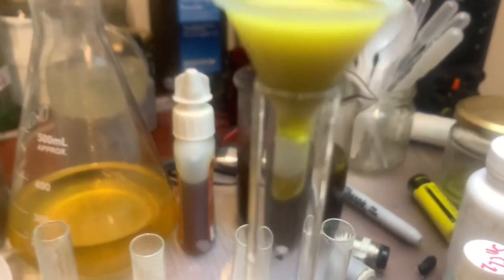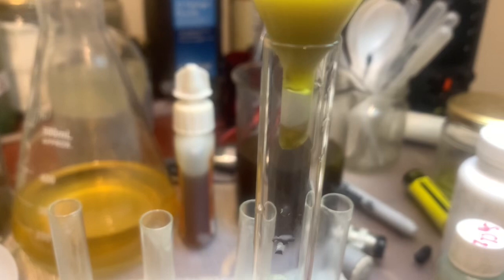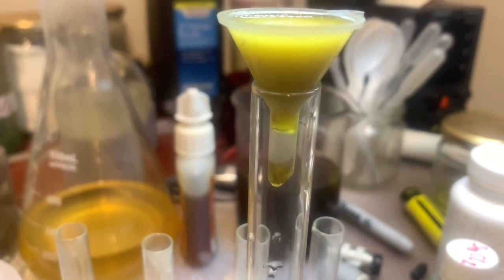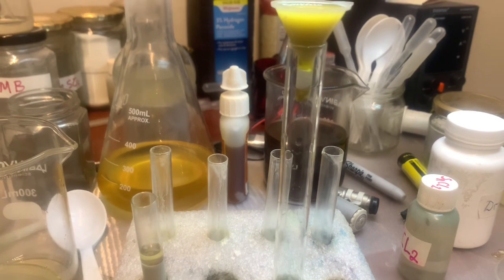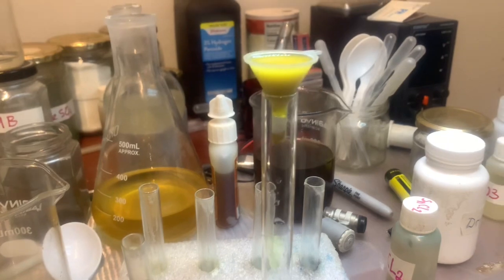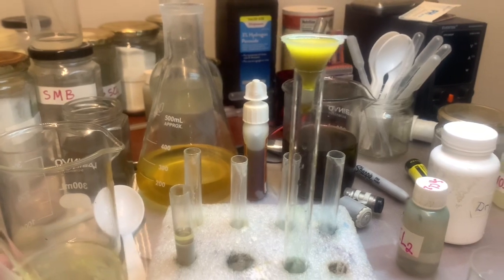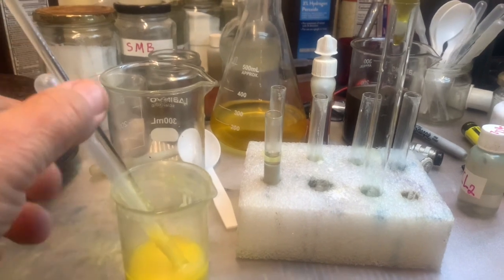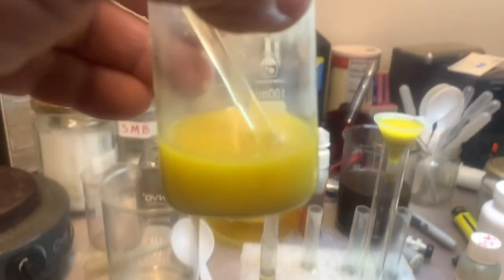And I see this filter get clogged right away. Oh no, it's falling, but that takes forever. Okay. Look how slowly, but it's clean. It's clean. I don't know. Let me think about, maybe I need to make a bigger funnel to filtrate this solution, or wait till it settles down and then filtrate. Okay. And still I got a lot of solution. I just don't like it that much.